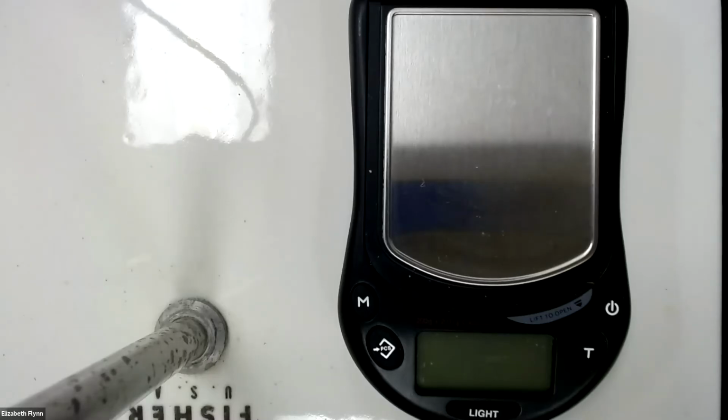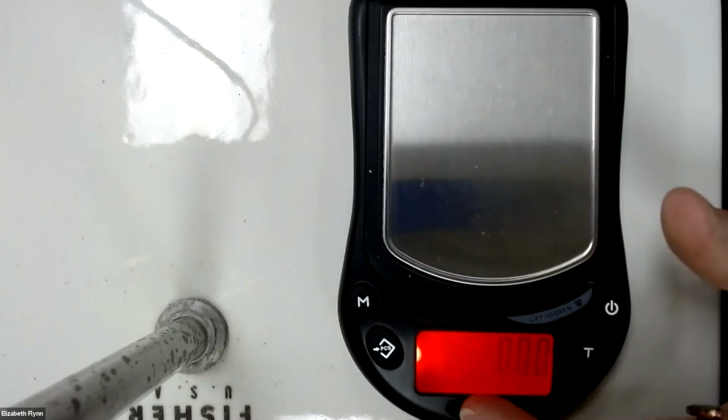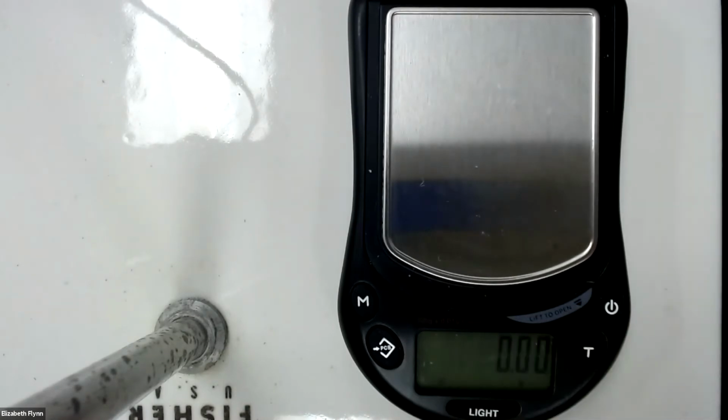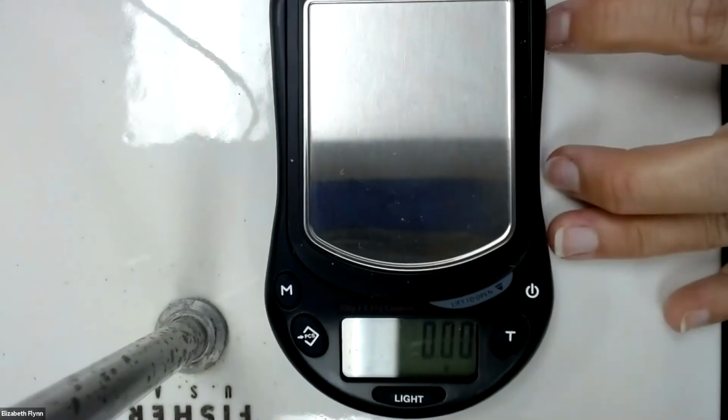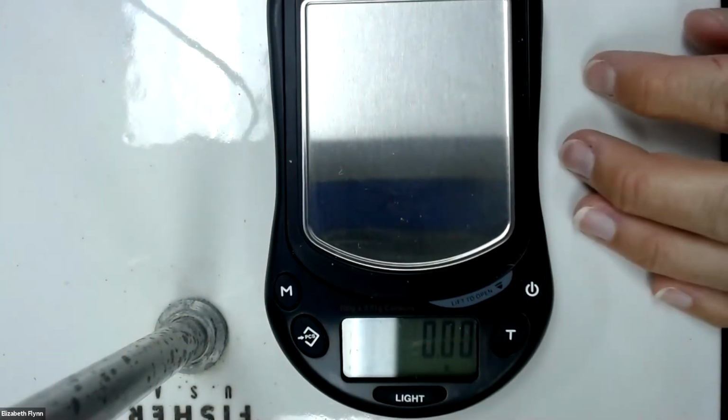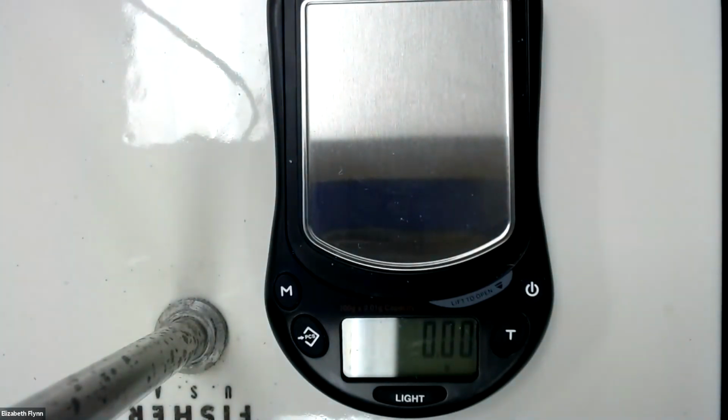All right. So one more, we're going to measure the mass of a penny. You're going to turn on your scale, and you can decide whether you like the light or not. I'm going to turn it off. I believe it's easier to see on the camera. Either way. Let me see if I can get that brighter. Okay. So your scales work like this. Well, I'll show you after actually. Let's just get the mass of the pennies.